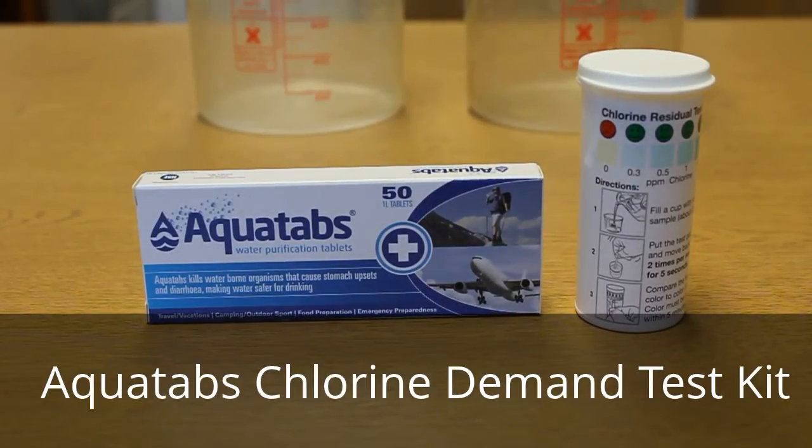This is a demonstration on how to use the Aquatabs test kit for testing the chlorine demand of water. The test kit consists of Aquatabs tablets, 3.5mg strength, and chlorine test strips.